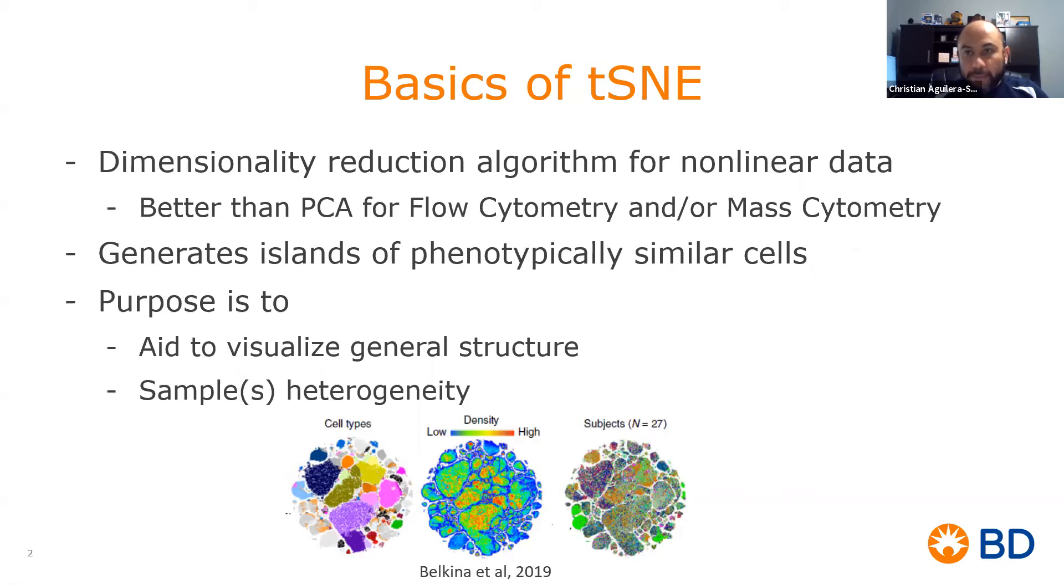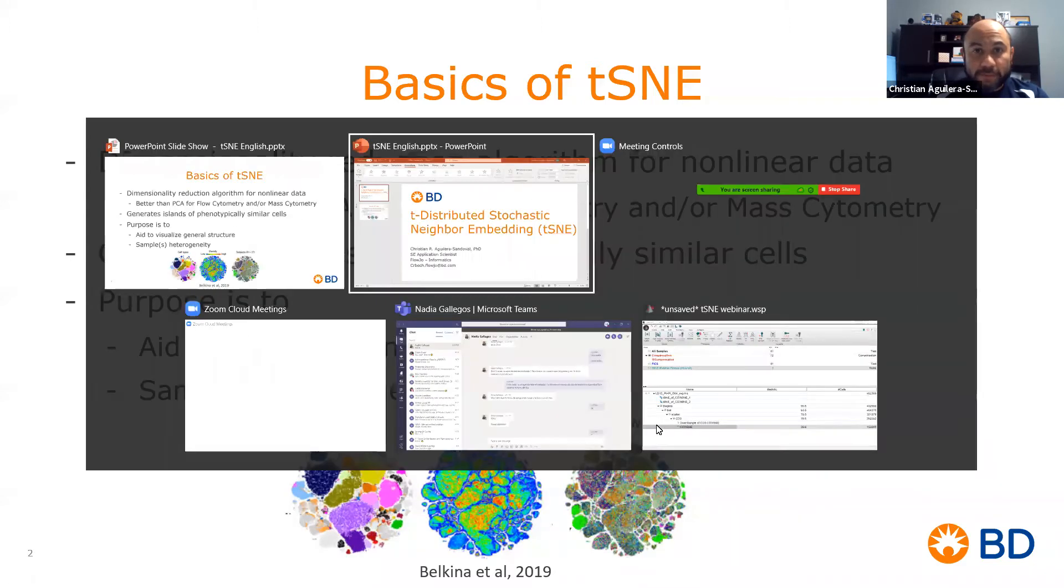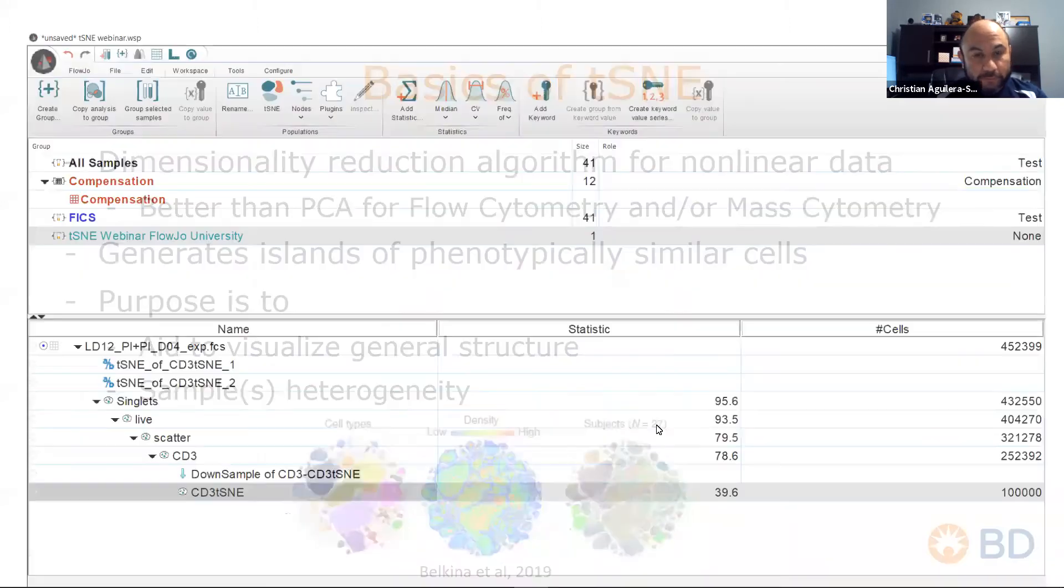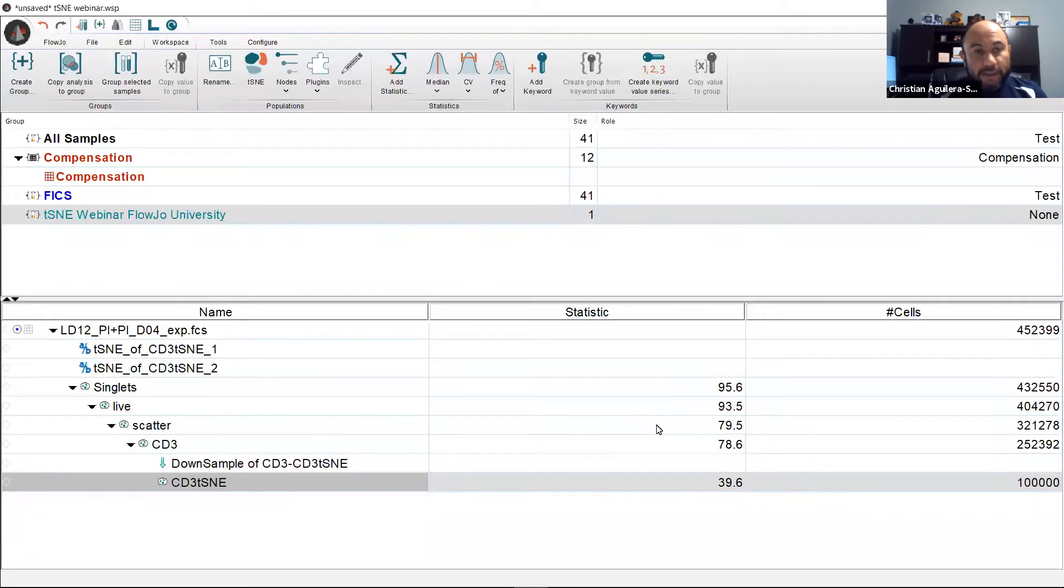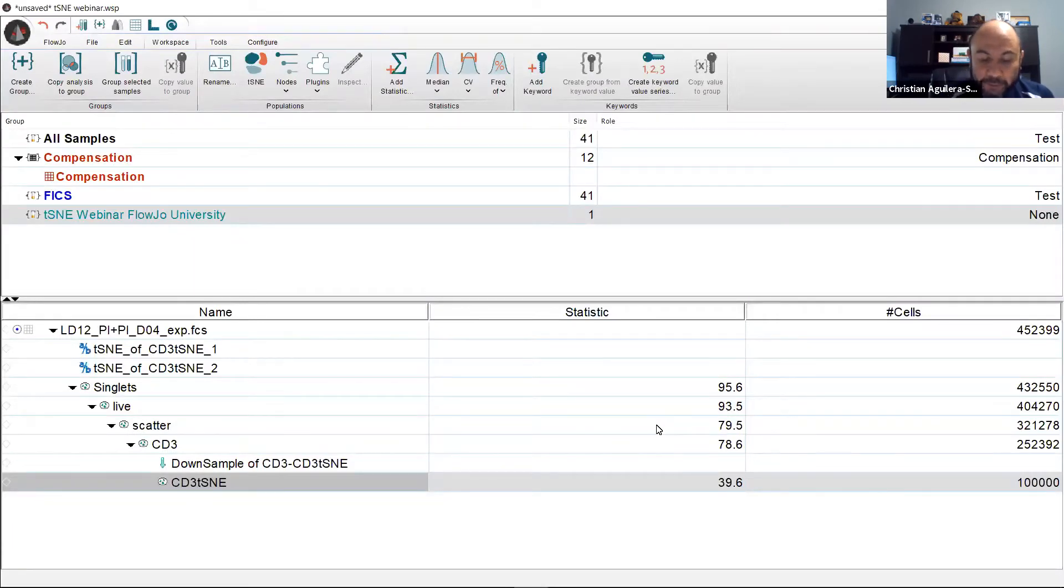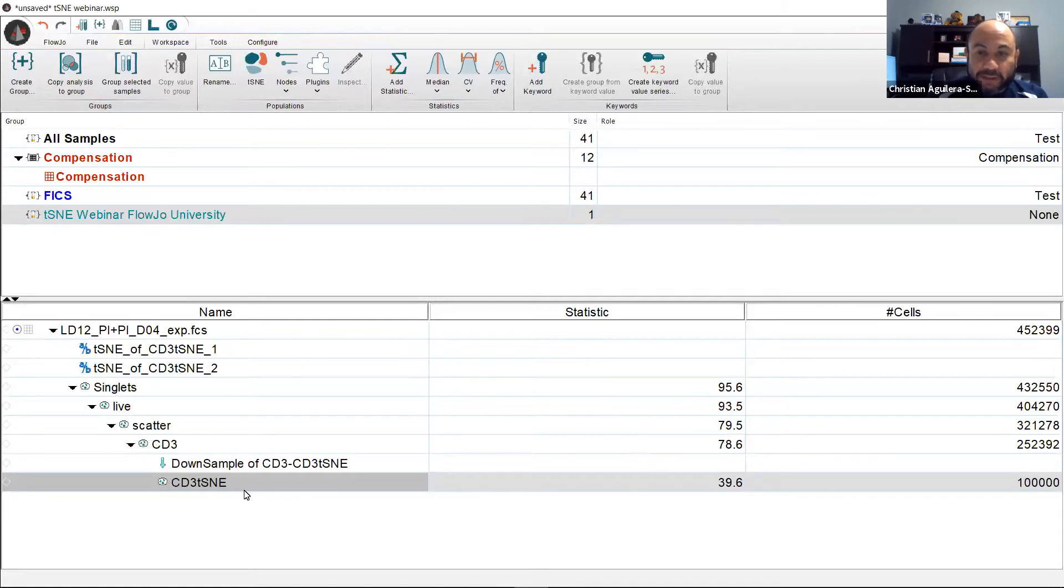Okay, let's do some t-SNE in an actual FlowJo workspace. Here I've taken the liberty to pre-gate this data set up to CD3 positive T cells as shown here.